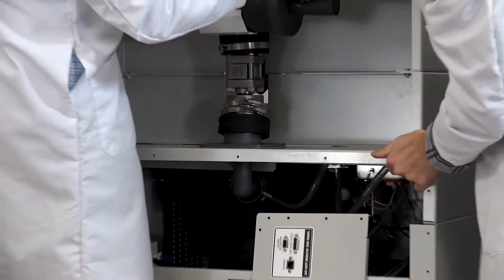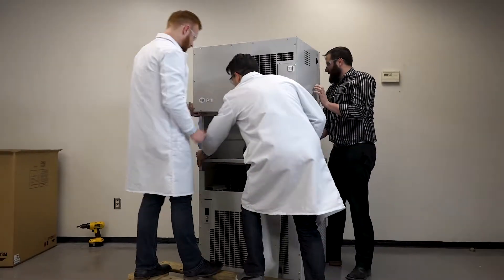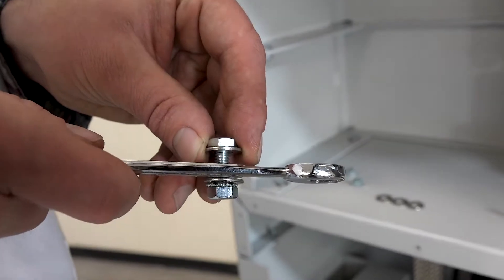Align the four mounting holes in the stopper and tray dryer support stand with the four holes in the top of the freeze dryer. Install the four bolts, nuts, and washers provided.